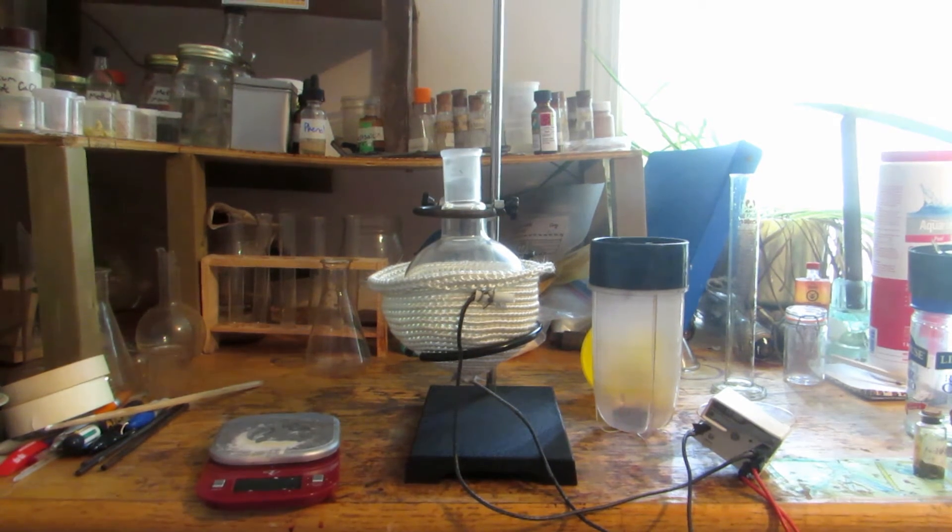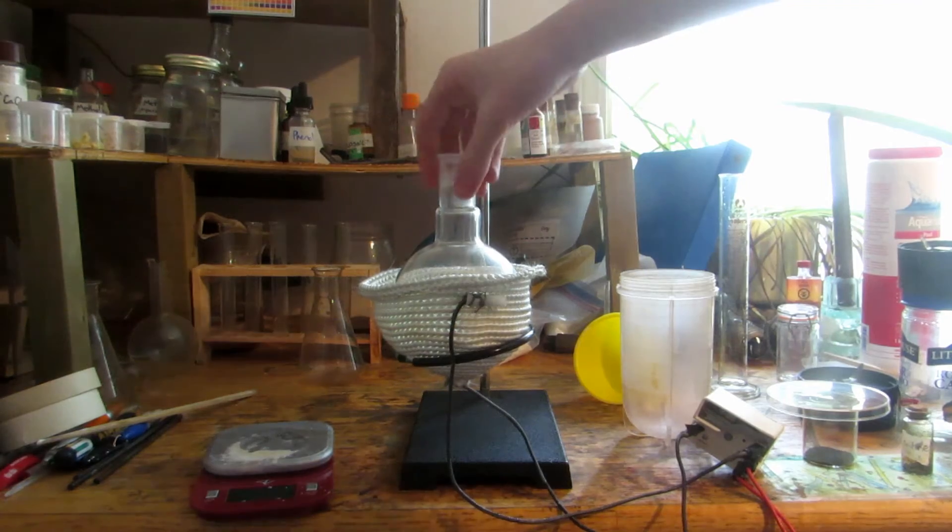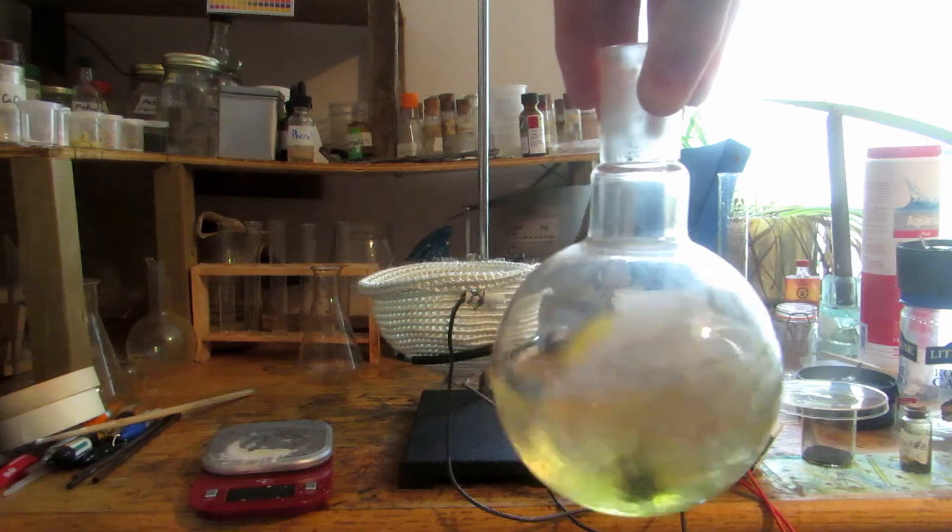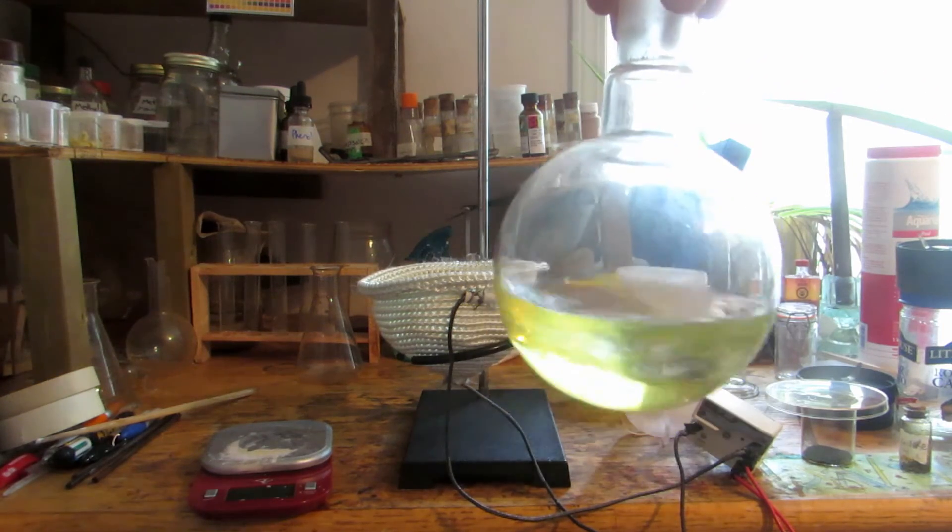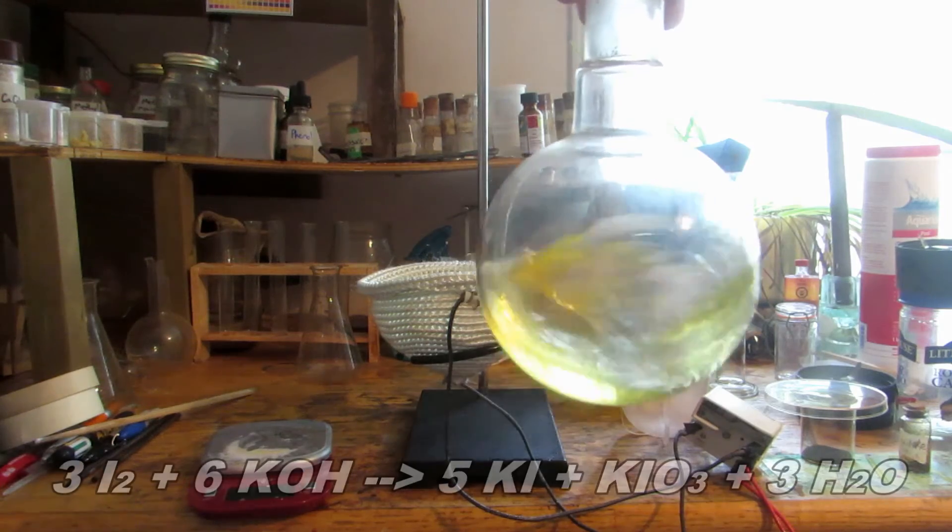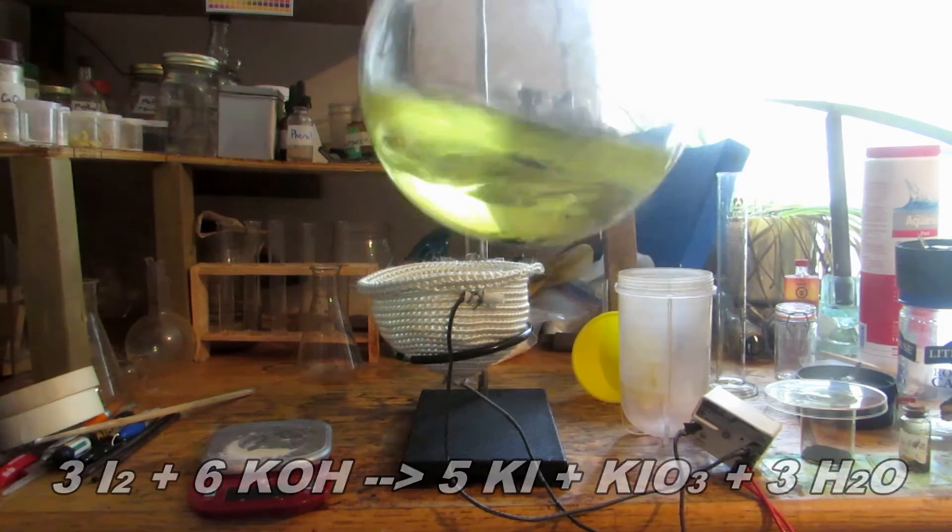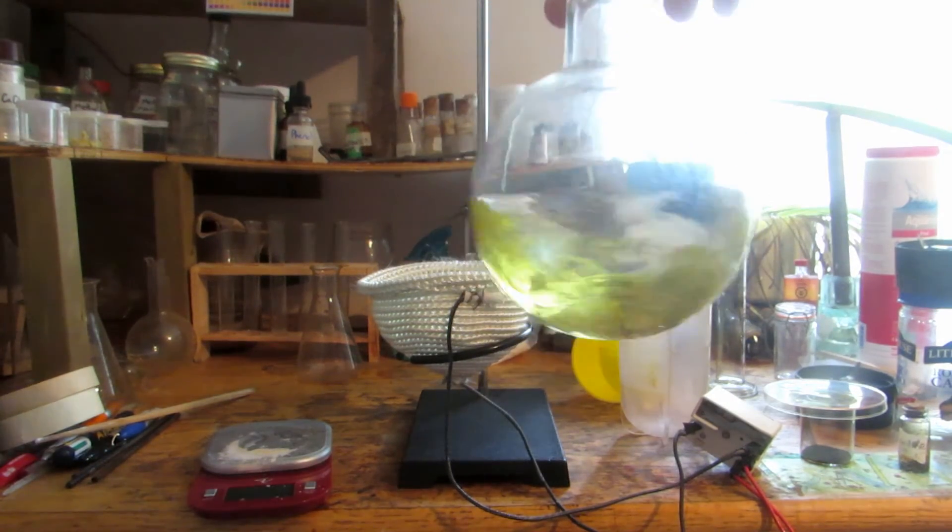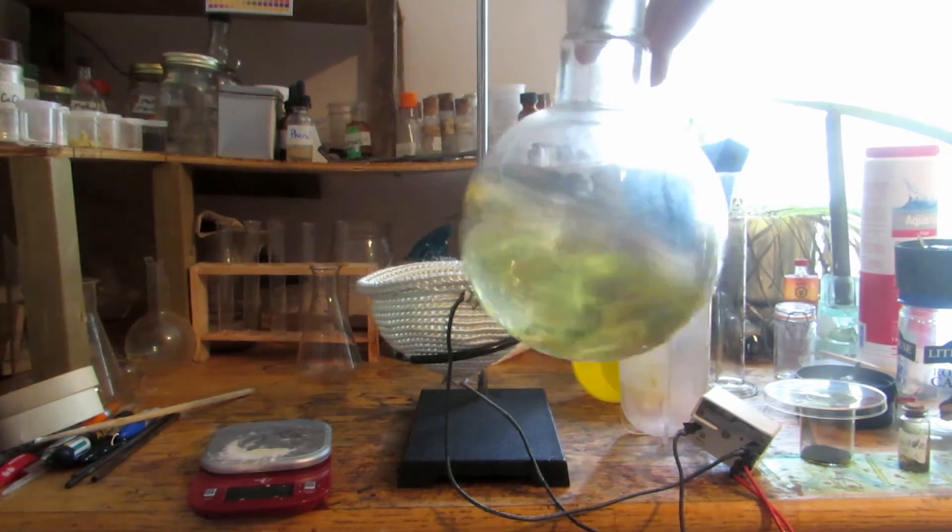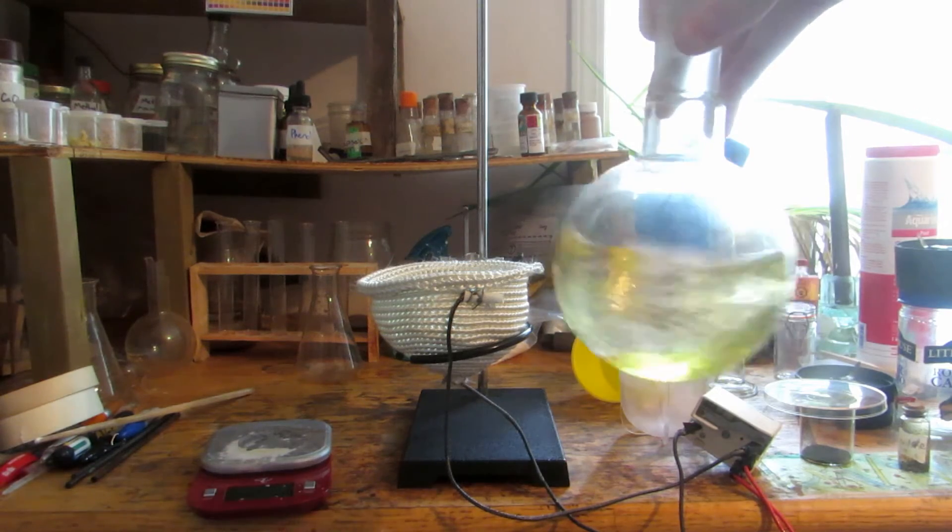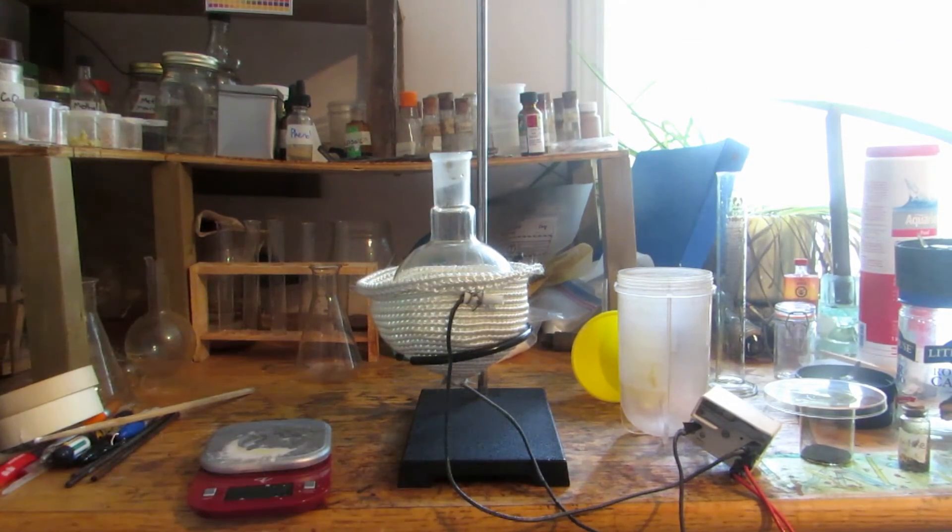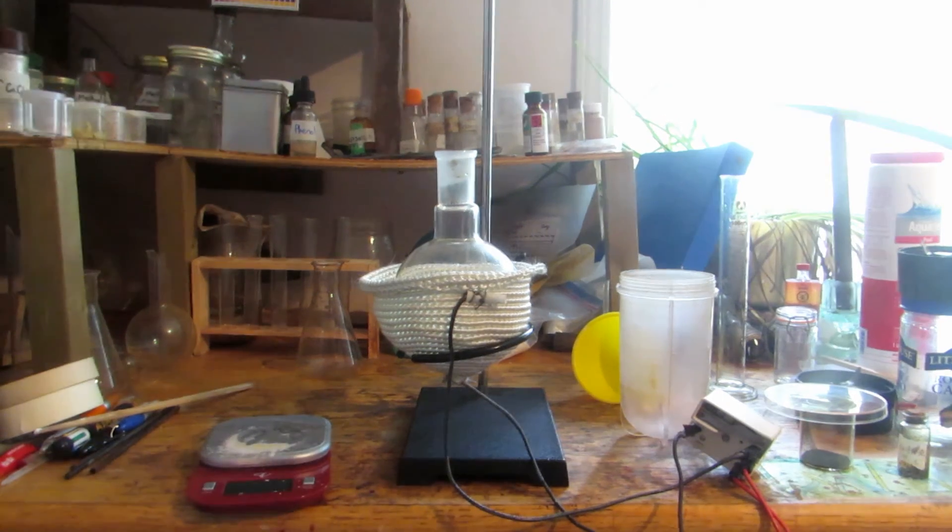I added a bit of iodine, and you can see in the bottom it's slightly colored yellow. If we swirl it around, it's starting to dissolve and react with the potassium hydroxide, forming a nice yellowish color. I believe this is because of the iodate. We'll continue to heat this and slowly add more iodine until we've reacted all of it.